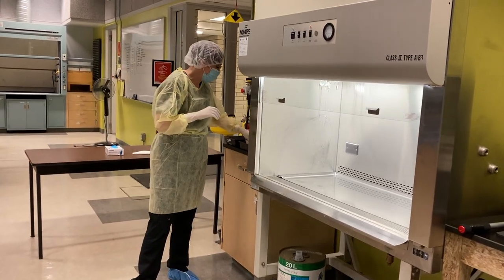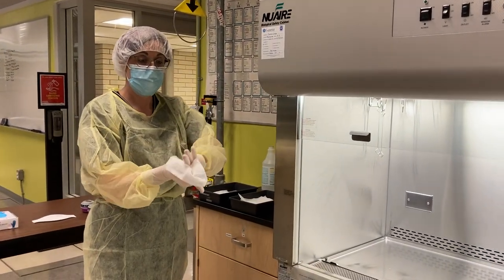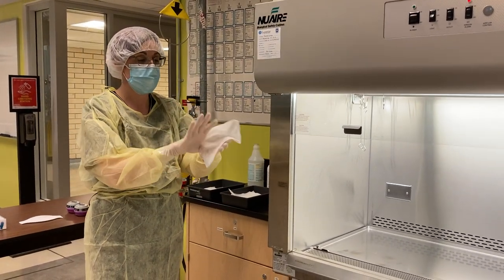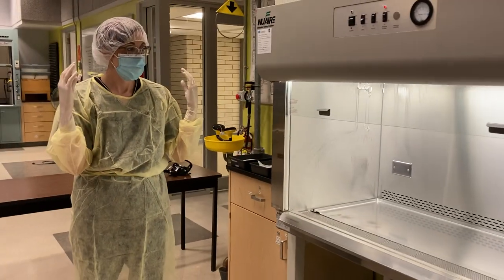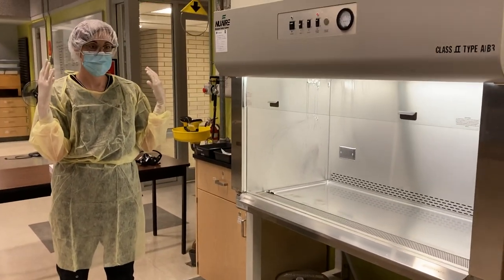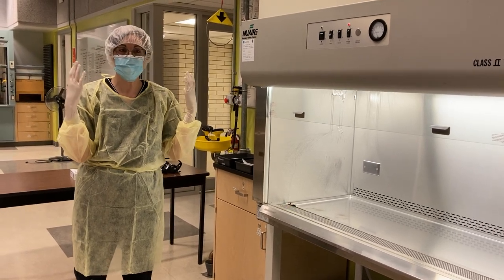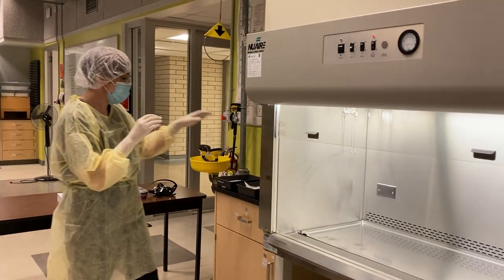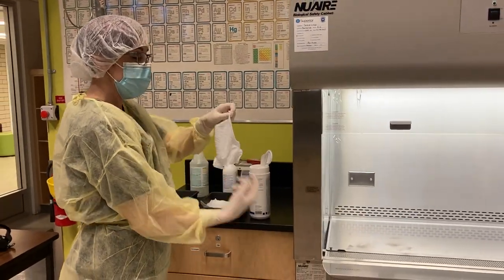So the first thing we're gonna do is we're gonna wipe our gloves with sterile alcohol. And just allow it to dry. It can take up to 20 seconds or more for the alcohol to dry on your hands. Once the alcohol is dried on your hands, you're going to take your germicidal agent. In this case, we've got pre-moistened wipes.